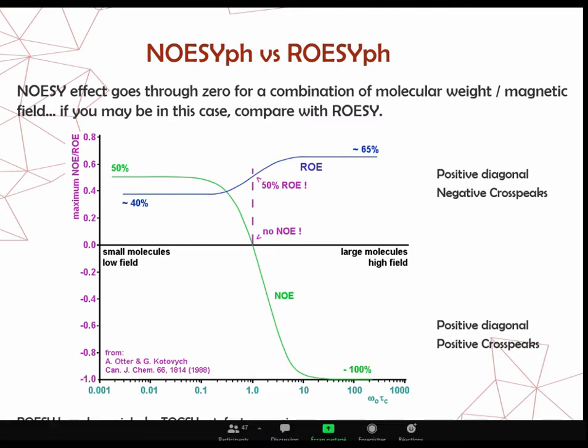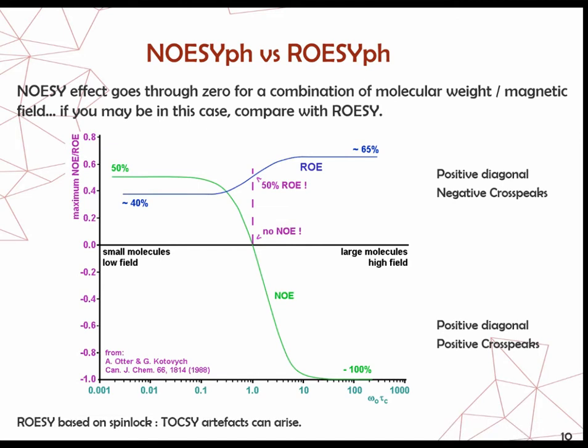One question for that: I notice when I charge my tubes, let's say for carbon, which I want to do during the day, I sometimes charge it with 100 milligrams. So the carbon is fine, but the proton sometimes looks really messy, because it's too concentrated. So typically I sometimes do 2 tubes, one only for proton, where I have 5 to 10 mg, and one for the carbon.